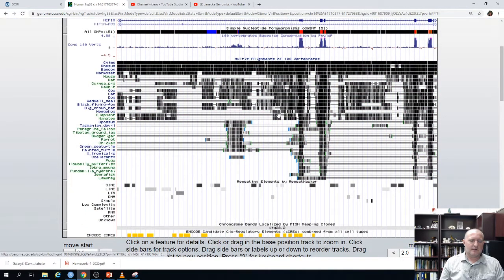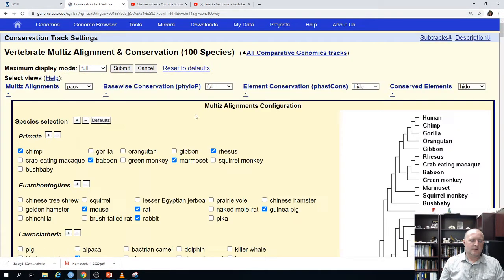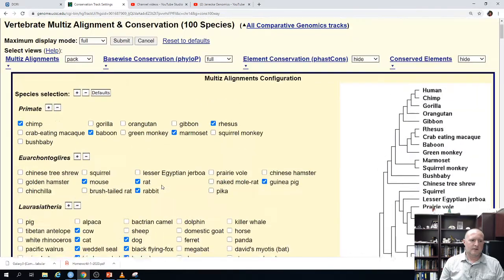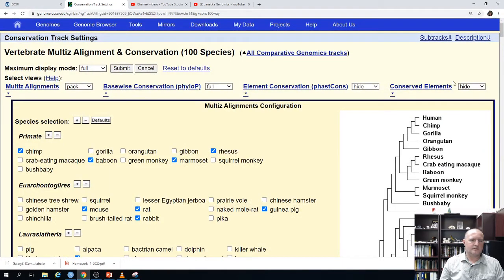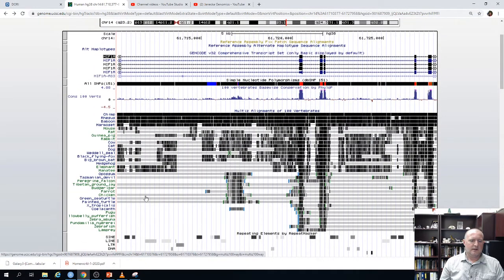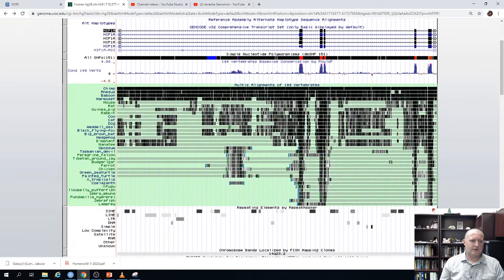Another really nice thing about the conservation track is you can add a layer where, if you click on it, we can select which actual species we want to see in the figure to get an idea of how conserved they are compared to the reference sequence. In this case, we have species like chimp, rhesus, baboon, marmoset, all the way down to elephant, manatee, opossum, Tasmanian devil. We also have some birds — peregrine falcon, ground jay, parrot — and even turtle, frog, coelacanth, fugu, pufferfish, and lamprey.